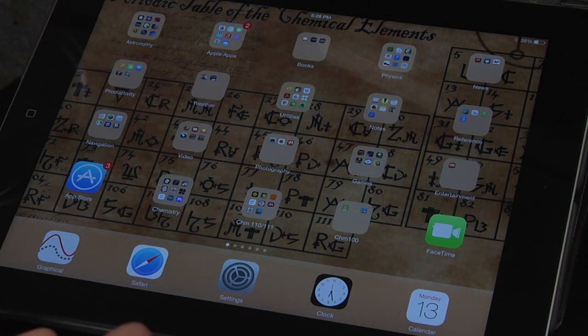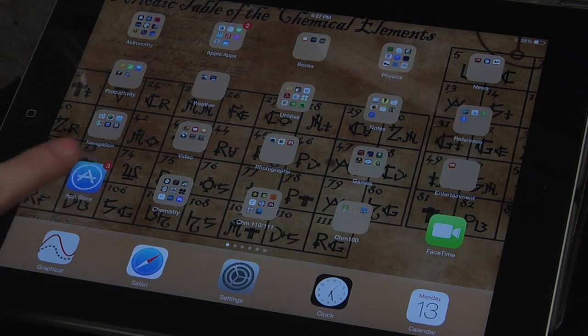Now to make your LabQuest communicate with the iPad so you can see your graph in real time and email it to yourself for your lab report, you're going to want to click on the Graphical app.